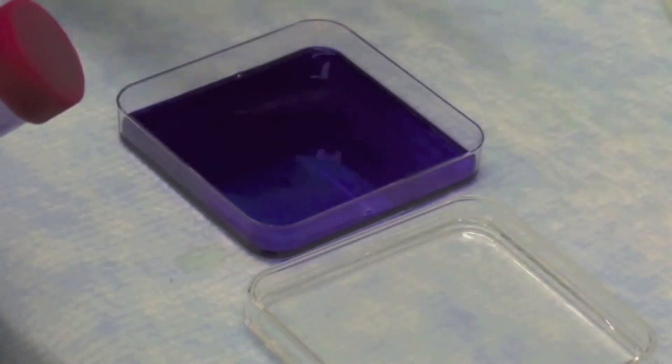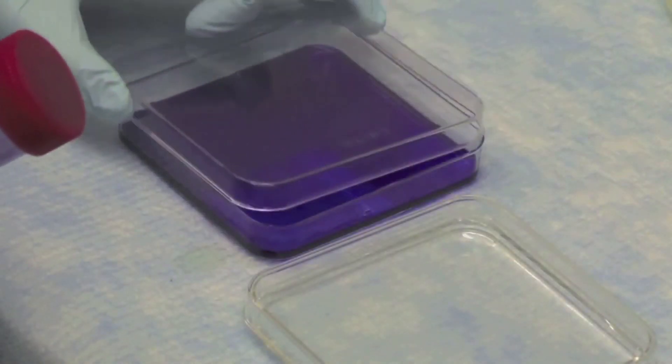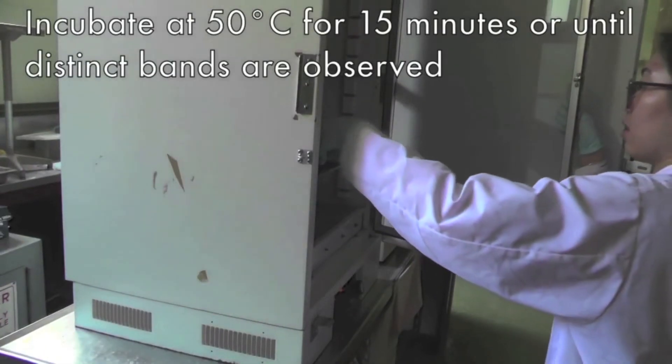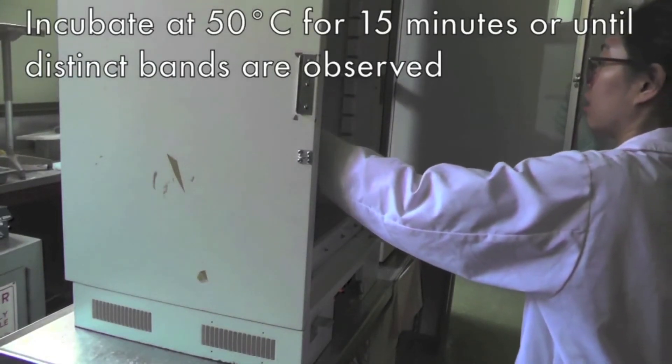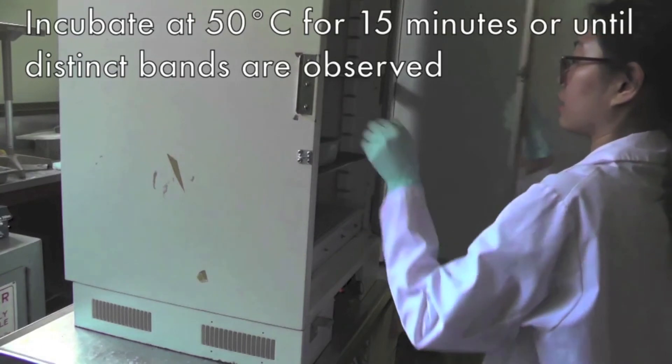Discard the washing solution, add Coomassie blue staining solution, place in a metal tray, and incubate at 50 degrees celsius for 15 minutes. Continue to stain until you can observe distinct bands on the gels.